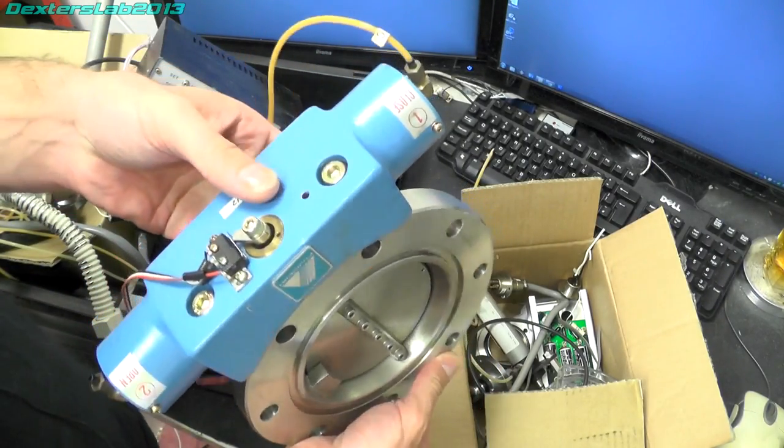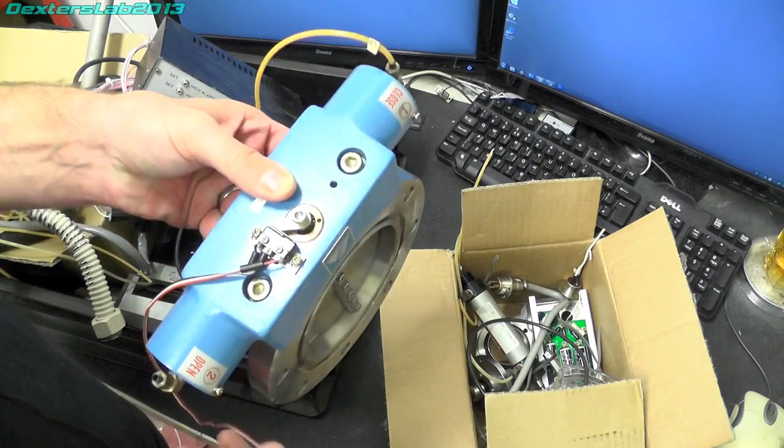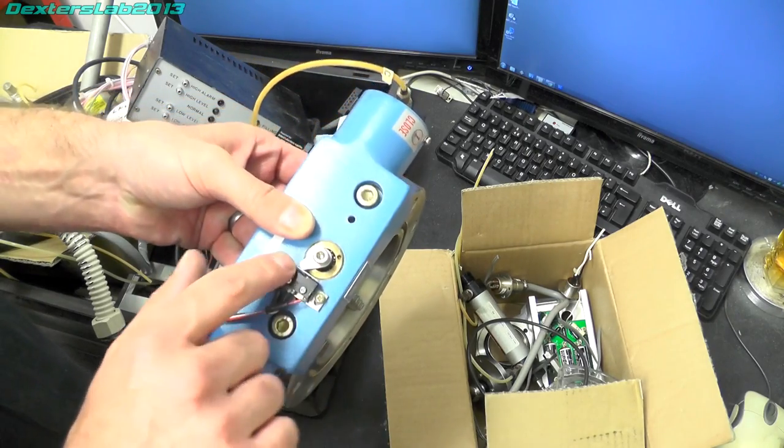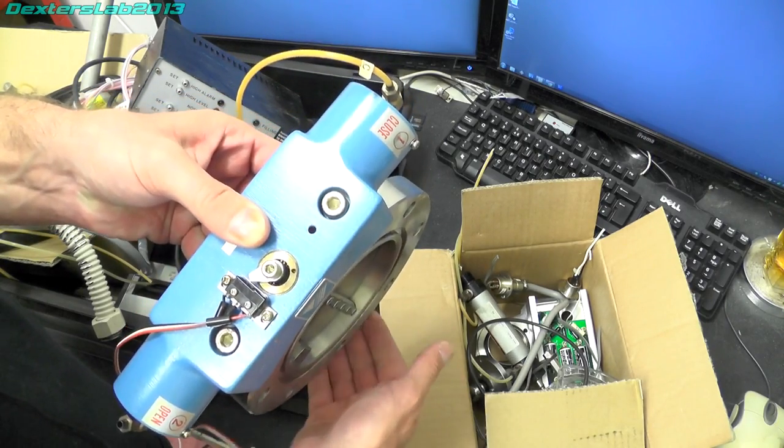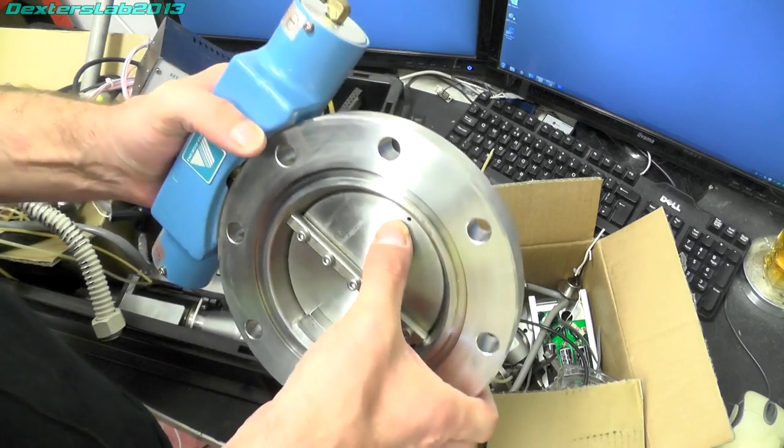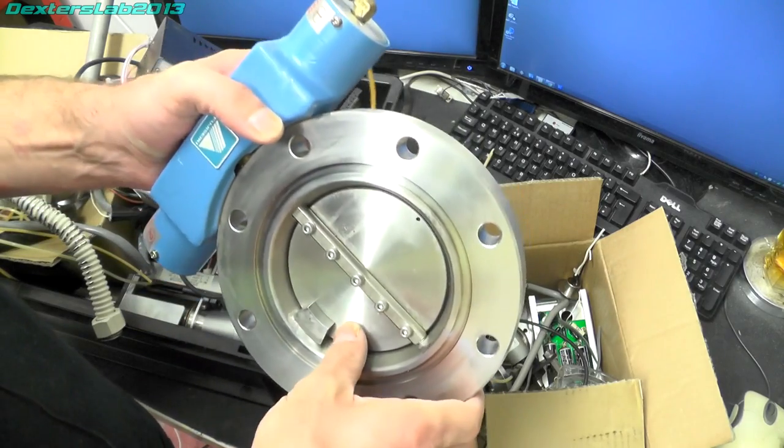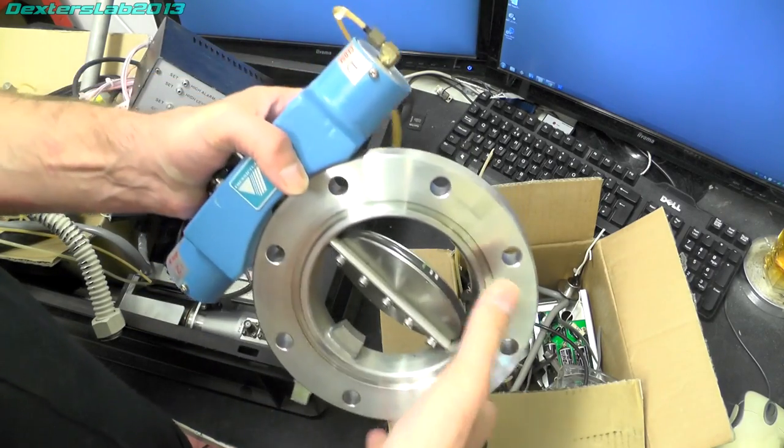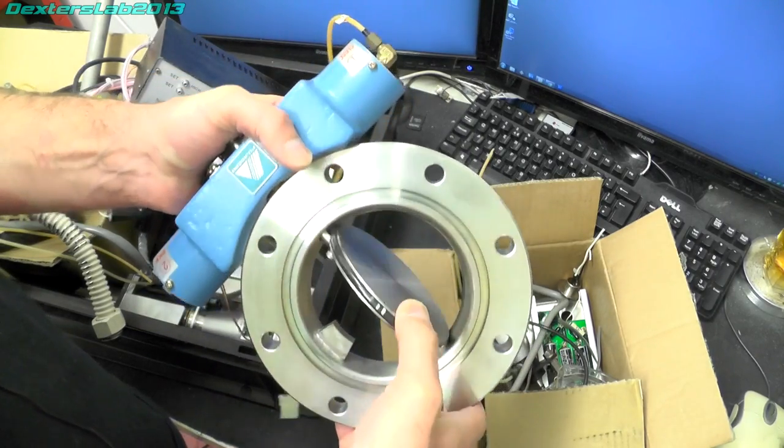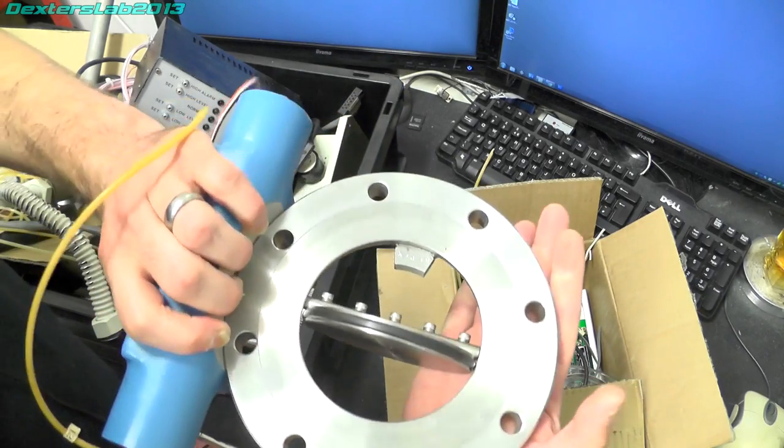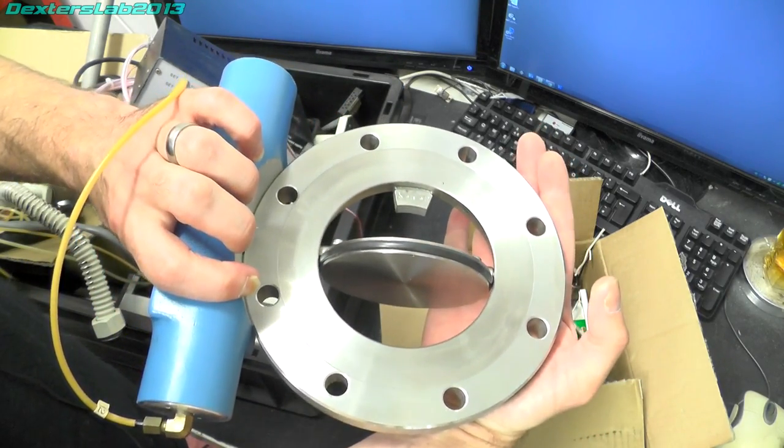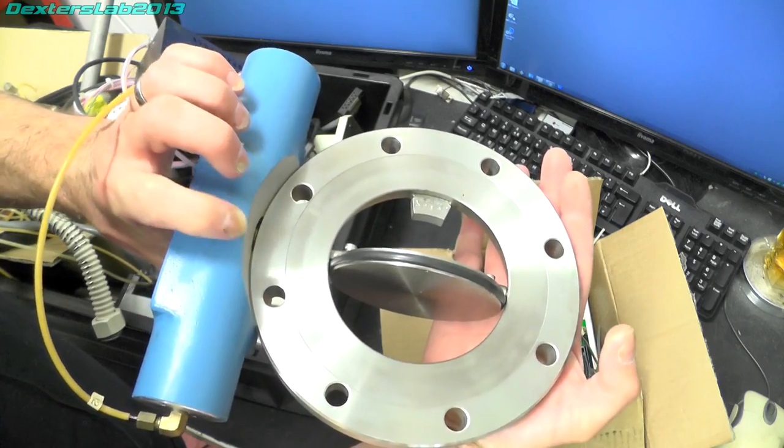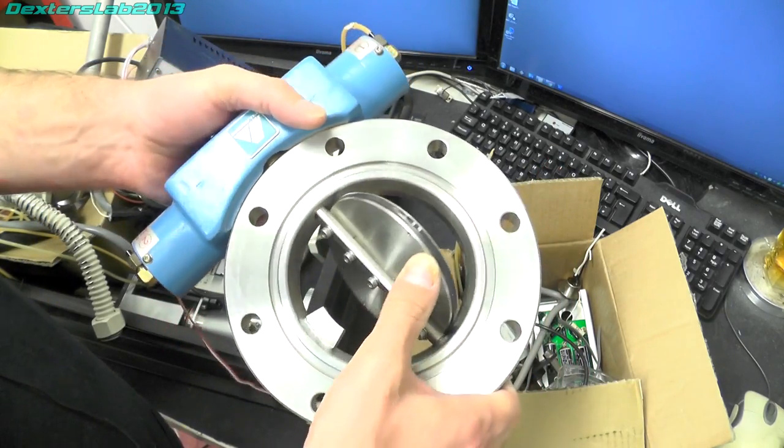It's pneumatically operated by this part here, there's a micro switch on here just to indicate its position back to the controller but this can just open and close and completely seal off the pump and baffles from the main chamber.